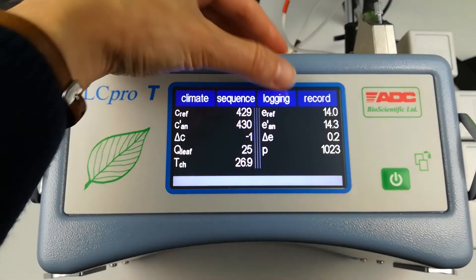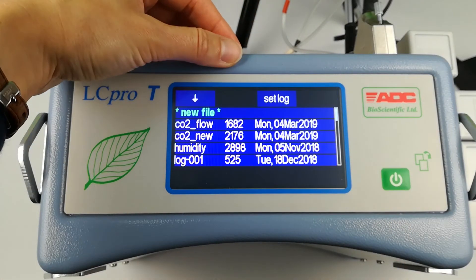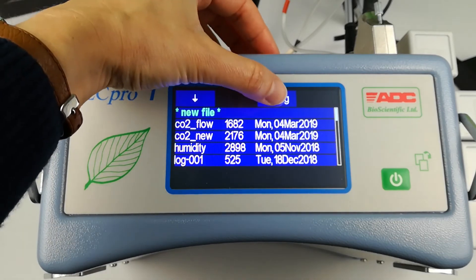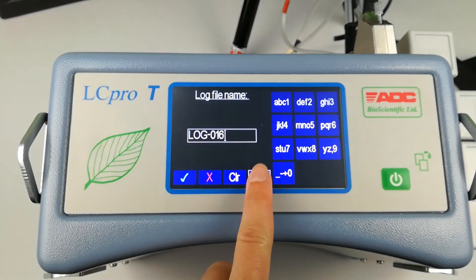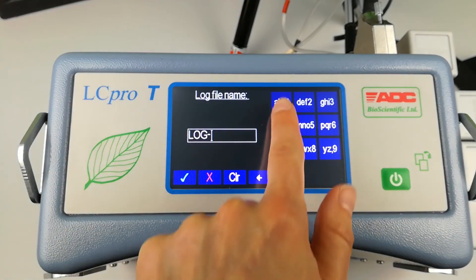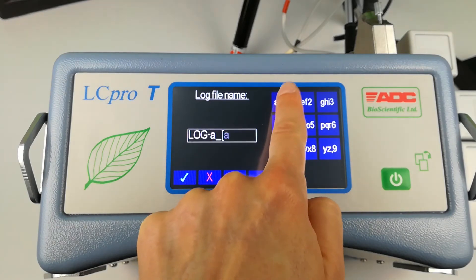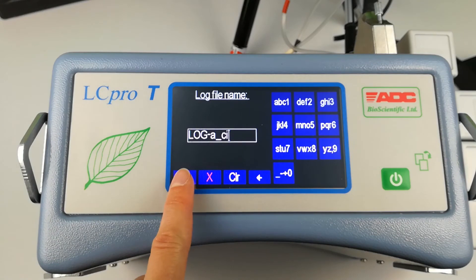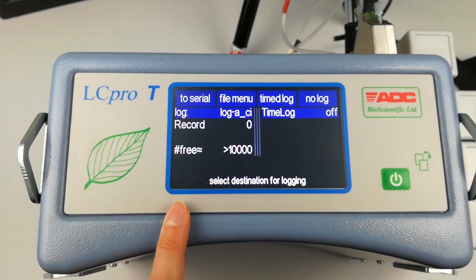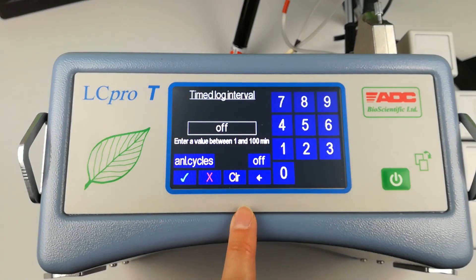Before taking measurements or records, create a data log file. Enter the logging menu and use the keys to name a log file with your choice of 7 digits, letters and numbers. The log indicates where the recorded data will be stored. Touch time log to enter a time interval in minutes.